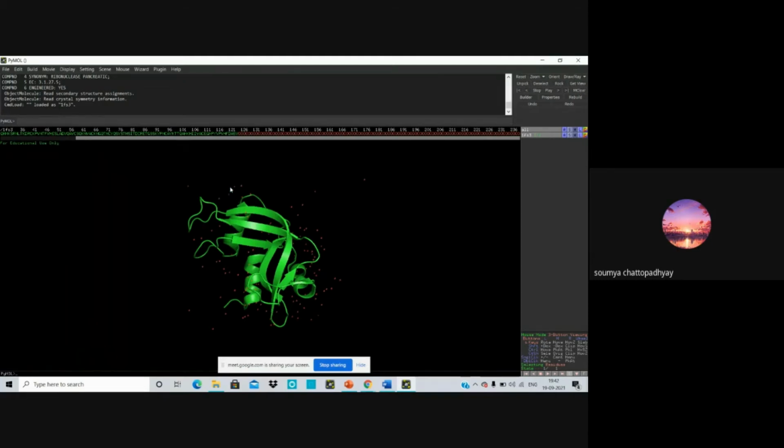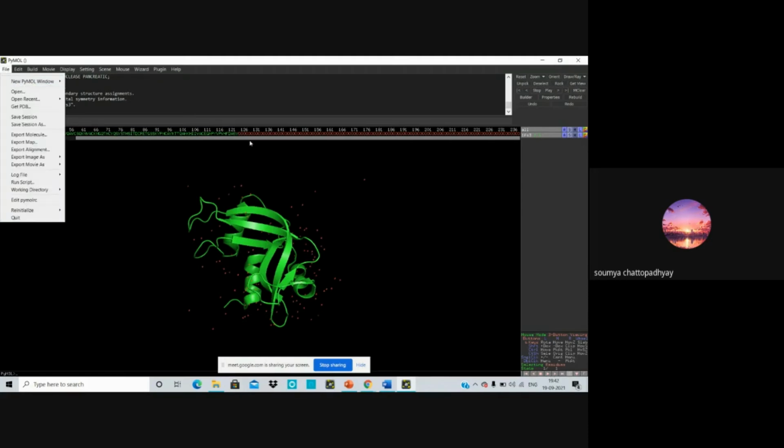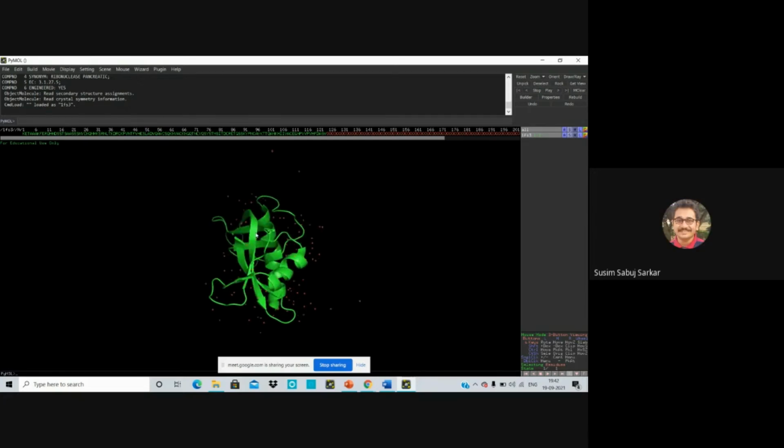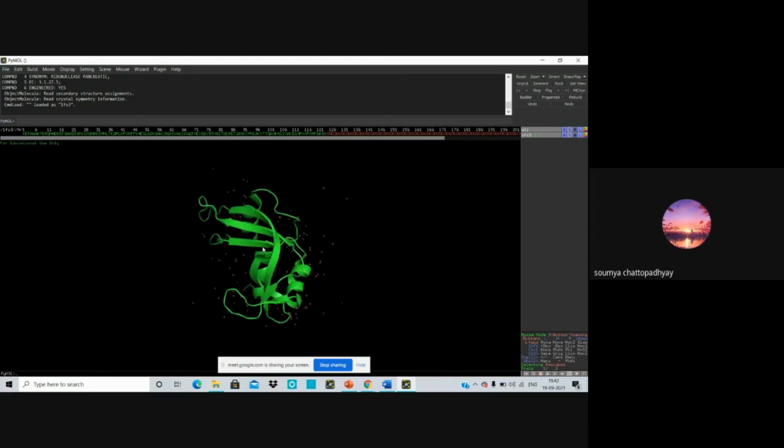These asterisks are the hydrogen bonds, and they can form hydrogen bonds with it, but you can't find a ligand. Even in the previous ones you could find in the sequence there is HEM, and there is CIT in the first human antigen which I showed. If I show it again, there will be a CIT after the amino acid sequence. Here you can't find a ligand in it. These are just the water molecules around this ribonuclease pancreatic. Okay, there is no ligand embedded in the structure.